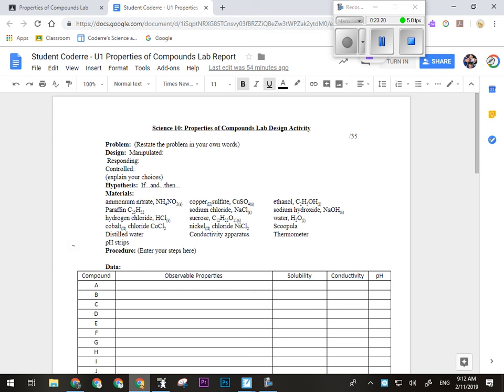So label it. I'll give you a Sharpie so you can do that. Again, that's something you'll probably want to have in your instructions. Be explicit. Label the depression plate. Go up to the front, grab small samples. Now, how much sample should I put in here? Should I fill this thing all the way up? Not if I'm going to run a solubility test where I add water. I would say probably the most you're going to want to fill this is about a third. Even that's probably lots. So fill the depressions about a third of the way full with sample.